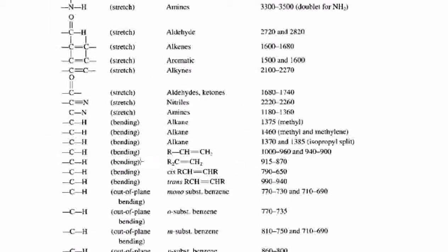All right, first entry we look at is this. If you have an alkene at the end of a chain, then in the bending region you will see, the table indicates, two peaks. The first one is on average 980, the second one an average of about 920.